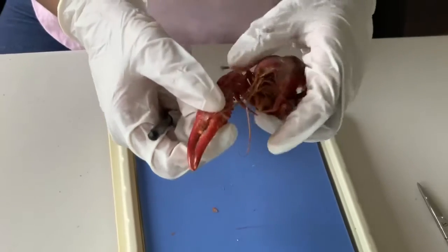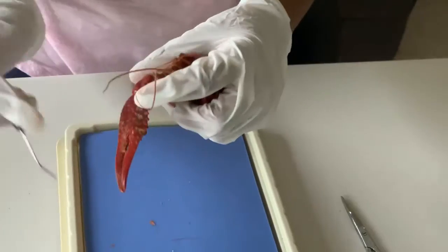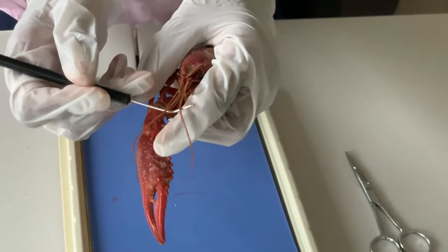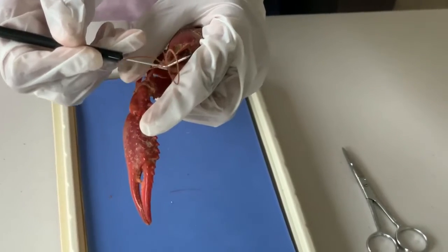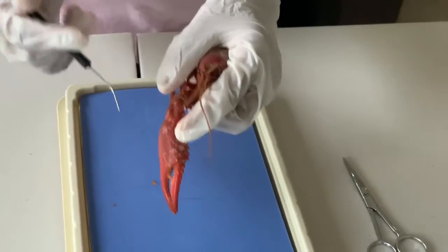Now why don't we take a look at the front. In the front, a crayfish has antennae, and these antennae help crayfish move when they can't see.